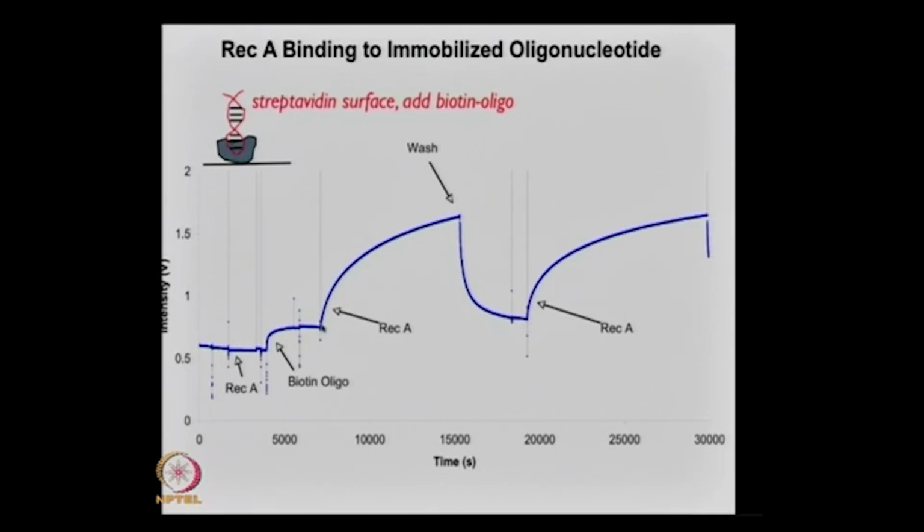And you can actually analyze these curves to measure the binding and unbinding kinetics of Rec-A and DNA. So this will be similar to what we're talking about in SPR, in terms of on rate and off rate. That's right, I think similar. So this is an on rate and off rate of Rec-A onto DNA. Similar both here and in SPR, one has to put together the correct model in order to extract the correct kinetics. So I think the software plays a role there, in how you best fit the model and extract the data.